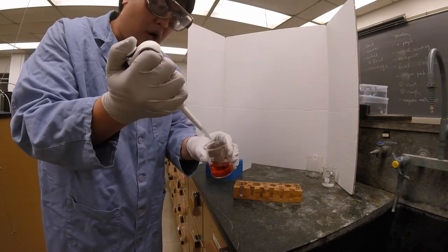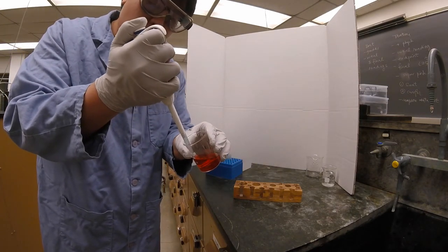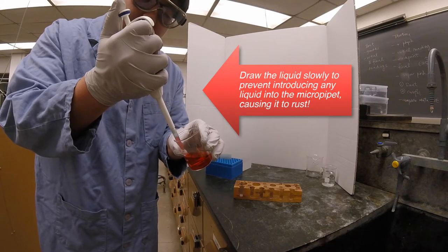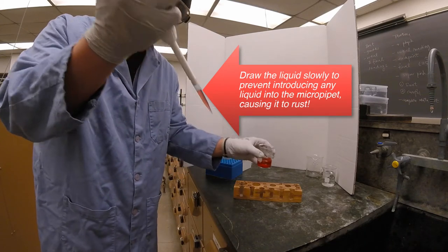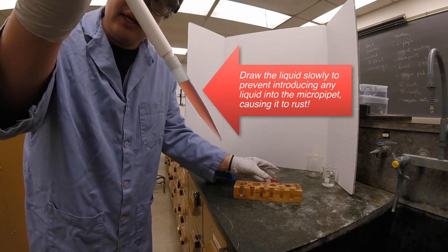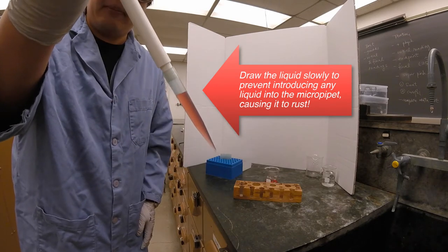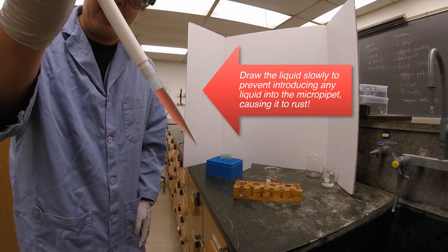Next you want to draw up your liquid slowly. And the reason is that if you draw the liquid up too quickly, it will shoot into the micropipette, and that might damage the device, and that would be really bad.